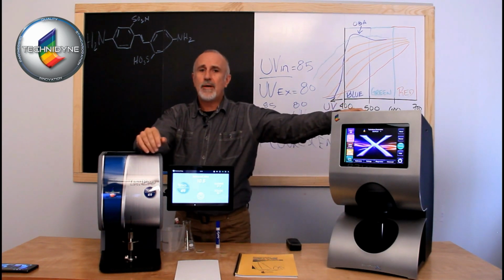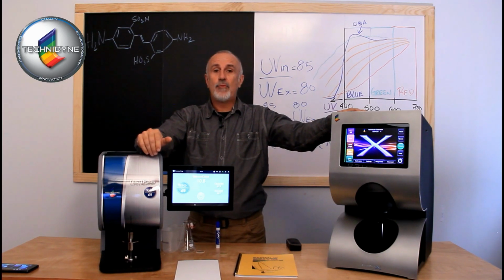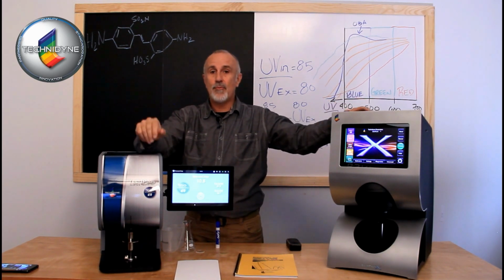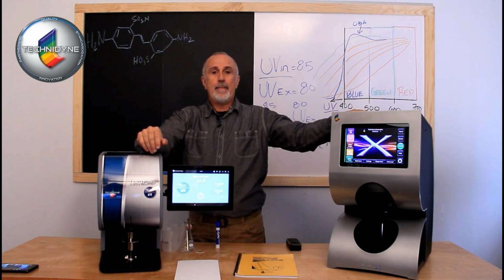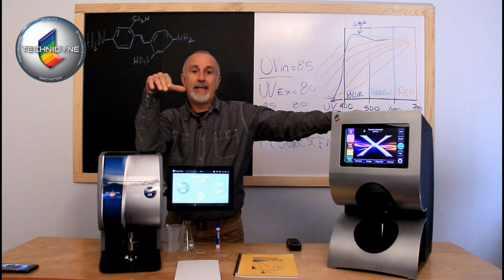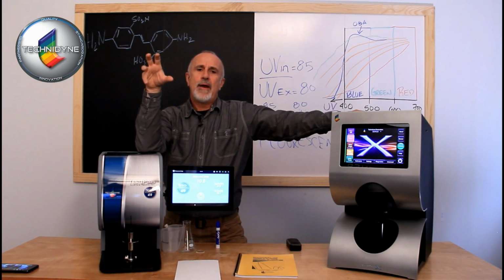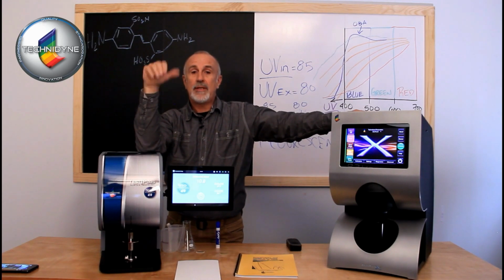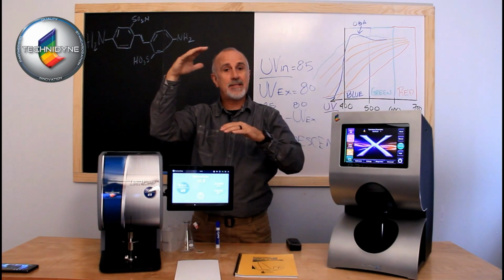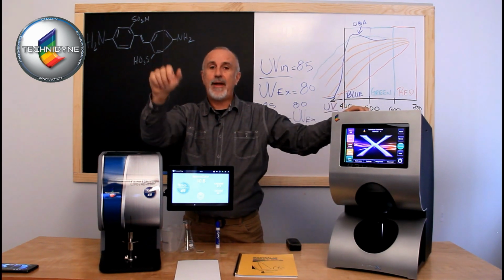When they did that as well, they also knew that people wanted a higher UV source level for doing a whiteness measurement. And you'll need to watch the whiteness video to understand a little bit more detail of that. But they wanted to be able to get a higher level of UV in there. A lot of that went around the ability to control the addition better, because if you expand your scale, the thought was if I expand my scale of control, then I have better ability to really fine-tune things.